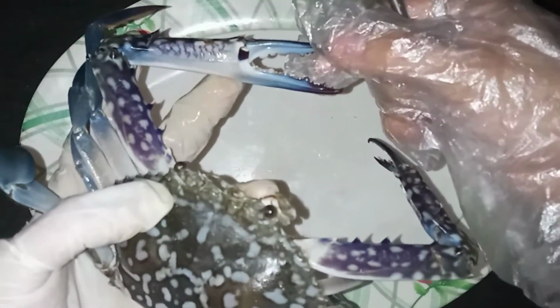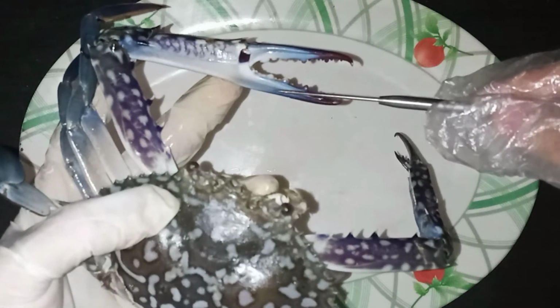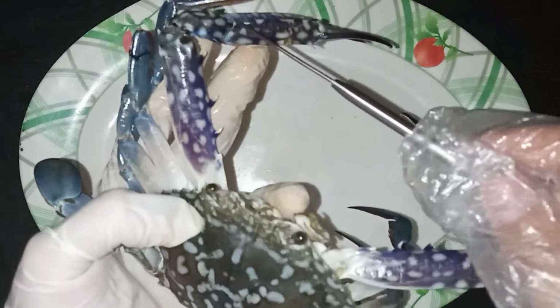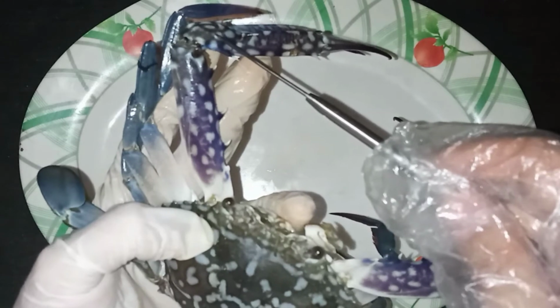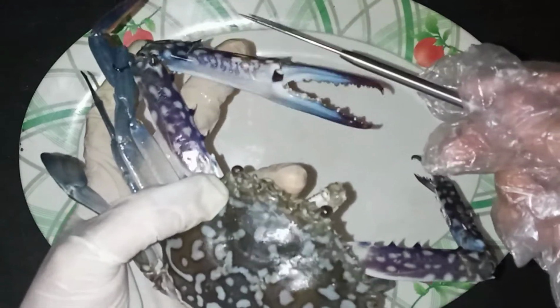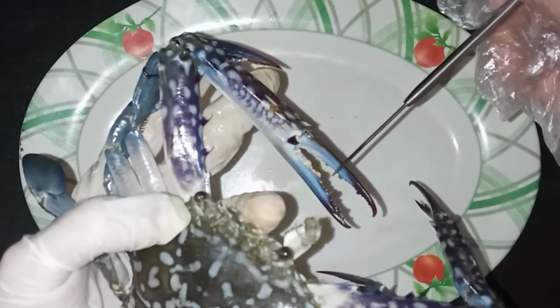These bigger legs of a crab also have the dactyl, also called the movable finger. This part is also called the propodus. This is also called the carpus. And this part is also called the merus. And this entire claw is called the cheliped.